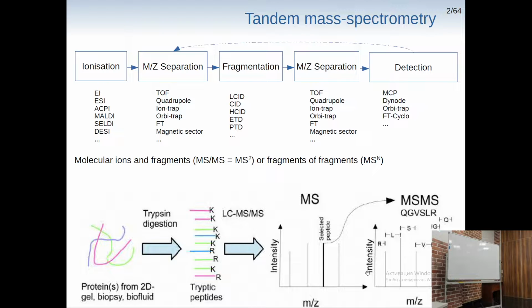Actually, nowadays two unique, or signature, it's the same name, peptides is enough to say that you have identified the protein. Not protein form, because those unique peptides can be different parts of your protein, and probably some post-translational modification is between them. So not protein forms, but proteins: just two unique peptides, or even one unique peptide and two non-unique peptides. Also not quite good, but it's possible to publish such results.